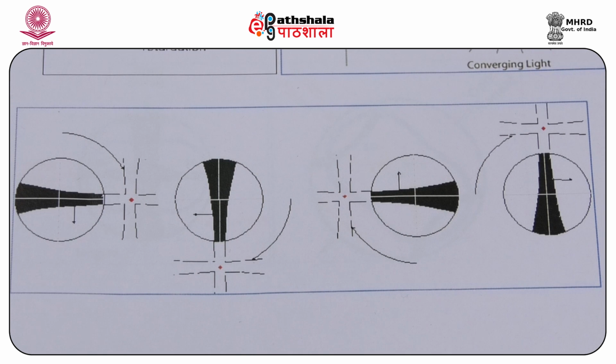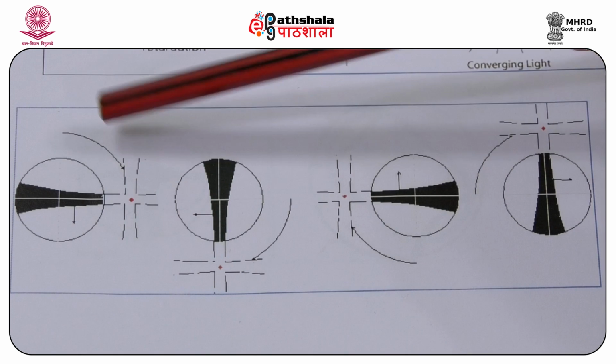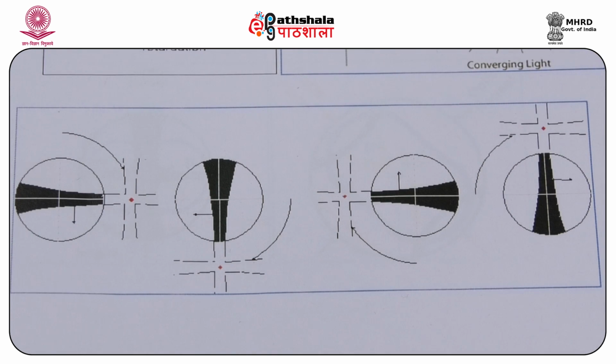When the optic axis is within about 30 degrees of being vertical, the melatope is visible in the field of view, resulting in an off-centered figure. As you can see here, this is an off-centered figure. Such a figure we call an off-centered optic axis figure.